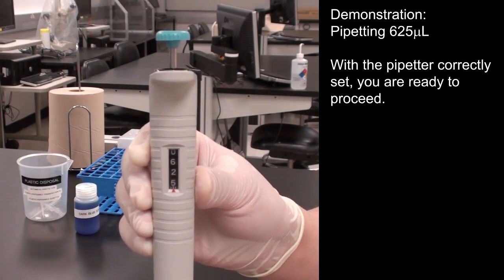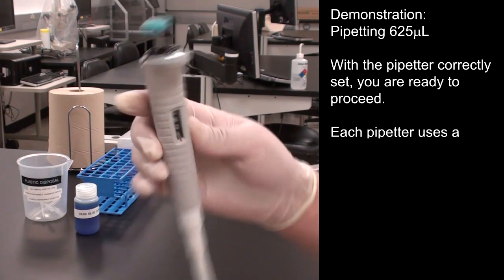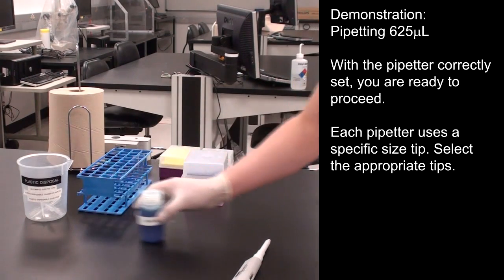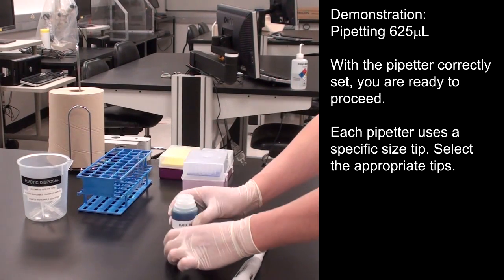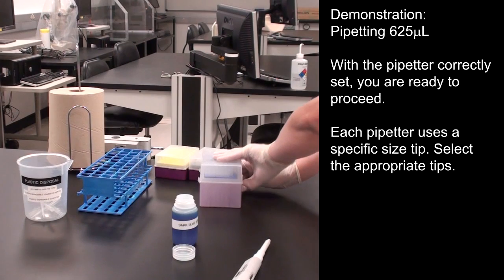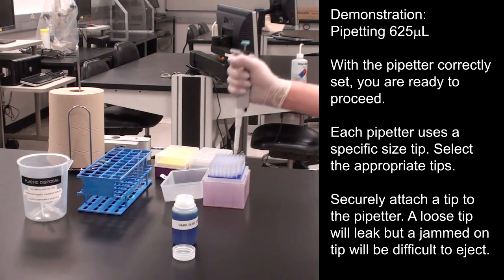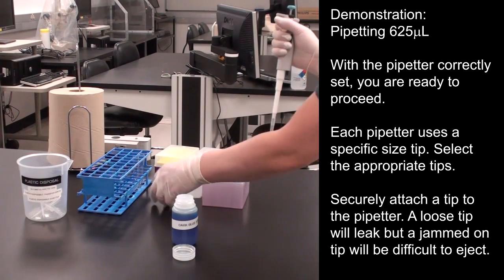With the pipetter correctly set, you are ready to proceed. Each pipetter uses a specific tip size. Select the appropriate tips. Securely attach a tip to the pipetter. A loose tip will leak, but if you jam on a tip, it will be difficult to eject.